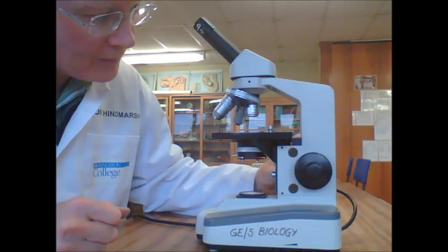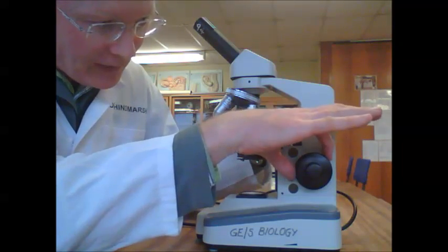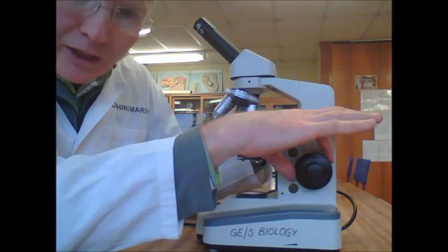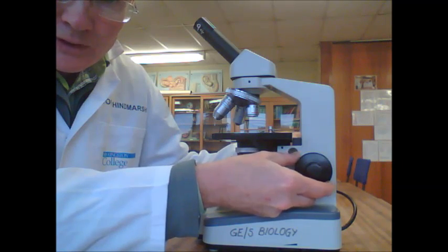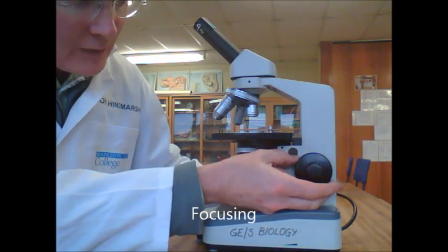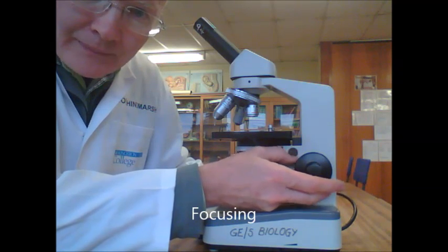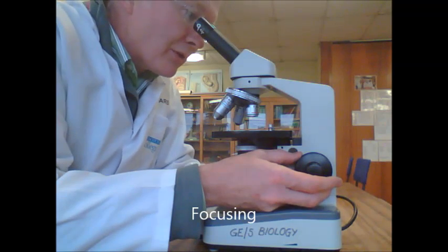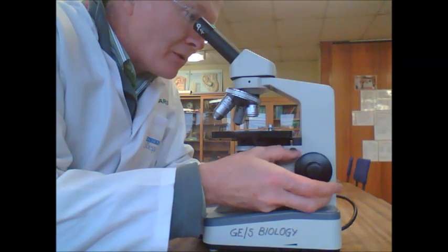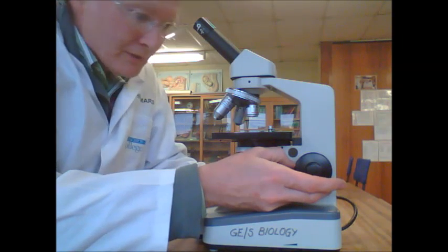To focus the microscope, this is the focus knob at the back — there are two knobs: a large focus knob at the back with an inner small knob. Take the large focus knob, and before you look through the microscope, bring the stage up as high as it will go until it stops. Then look through and go down into focus. You shouldn't need to move very far to come into focus.